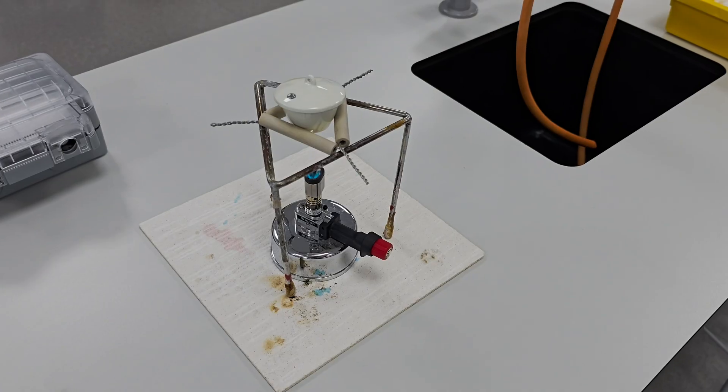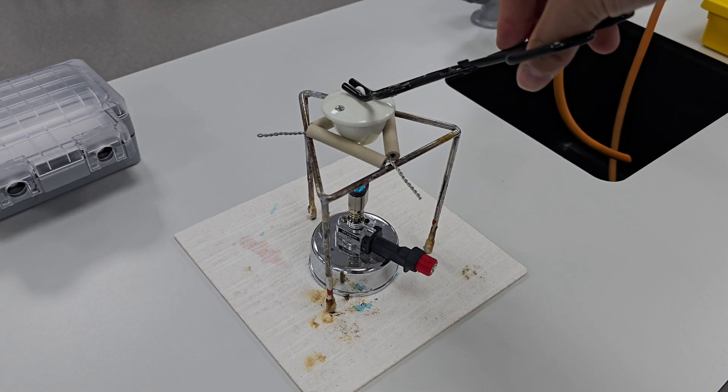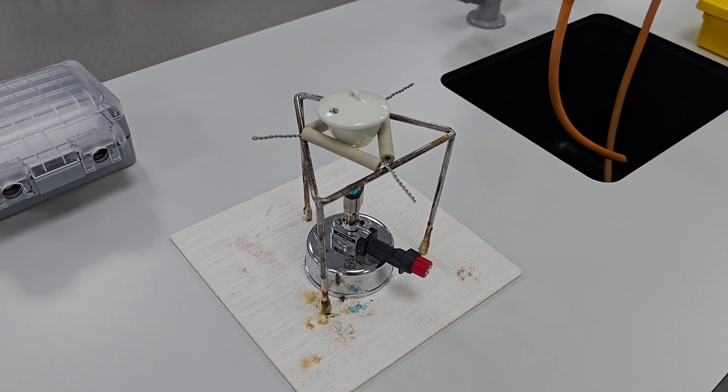Let's heat the crucible again for a couple minutes to make sure all the magnesium has reacted. Then we'll measure the mass again. If it changes we know we need to keep heating it until the mass stays the same.